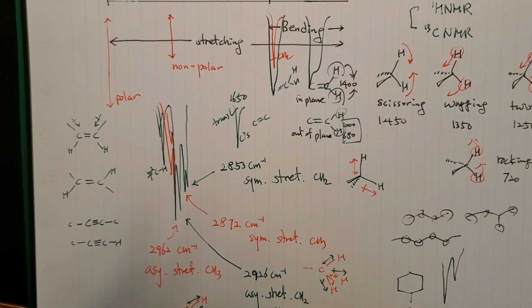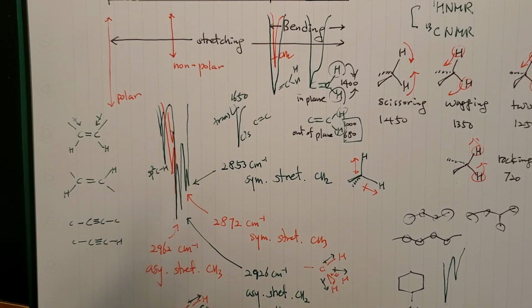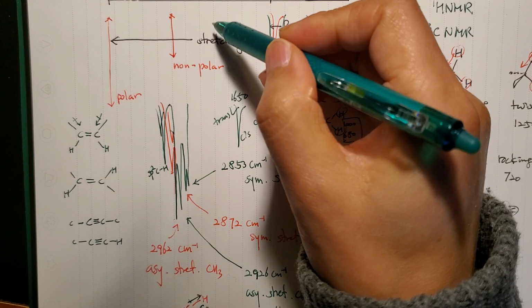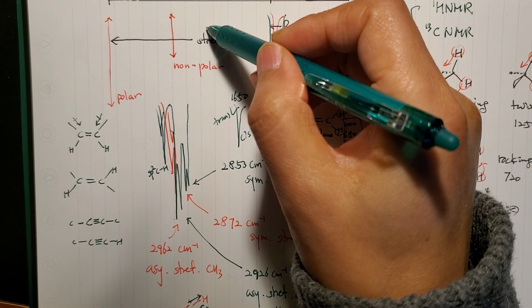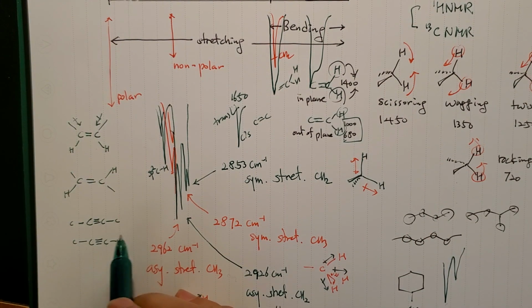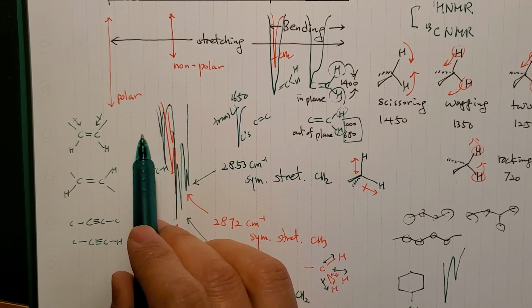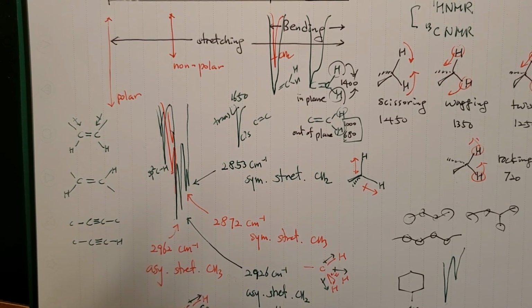And if you happen to have more polarization with resonance or some electronegative atom nearby that causes polarization as well, the signal, the peak, can be very intense. That means the CH also can show up around this area, but somewhat bigger. I wouldn't pay attention to the number too much as far as it's bigger than 3000 reciprocal centimeter frequency.